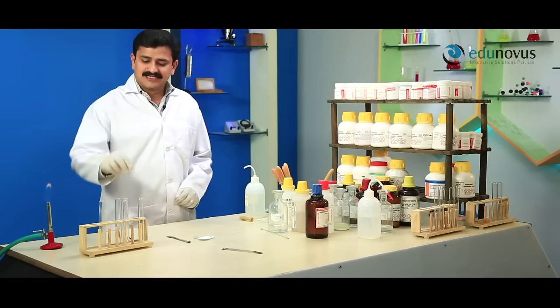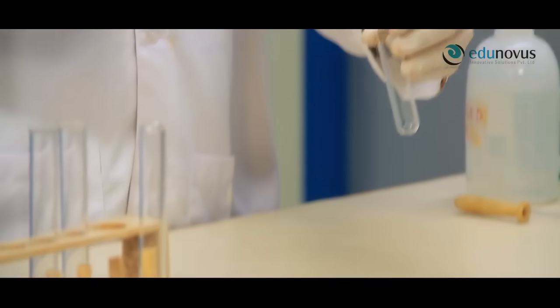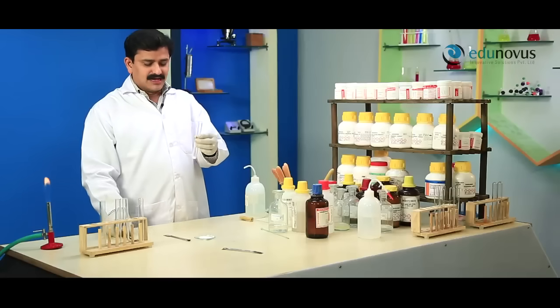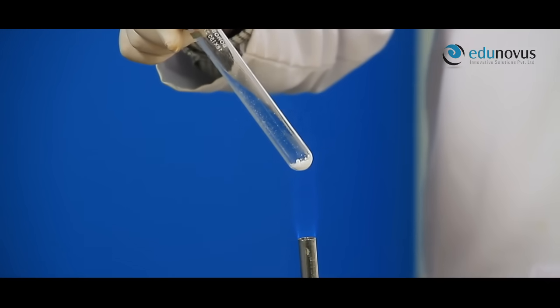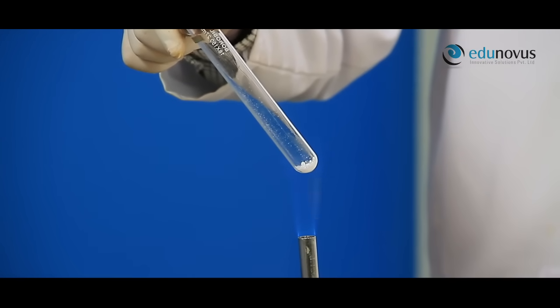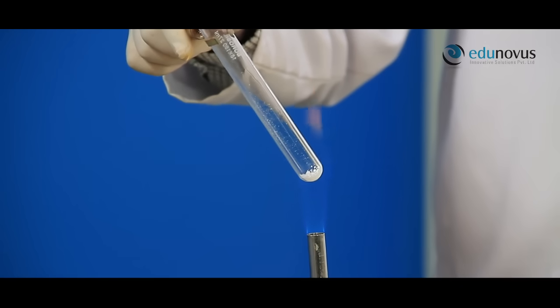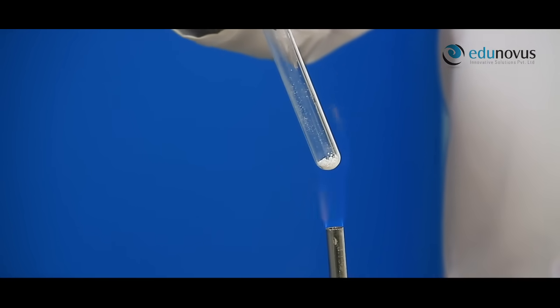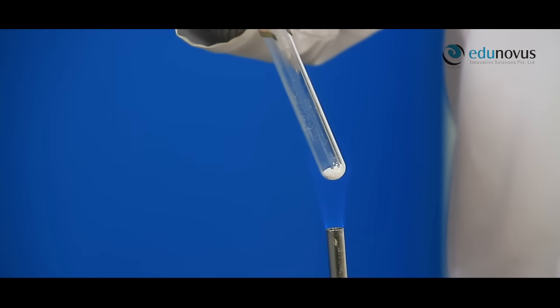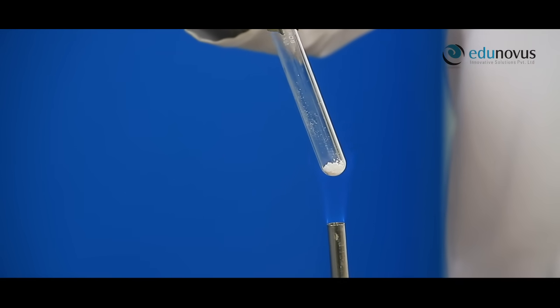Take a small amount of given salt in a clean and dry test tube and heat it using Bunsen flame. If a white residue is formed which glows on heating, it infers that the given salt may contain magnesium, calcium, barium, strontium or aluminum cation.